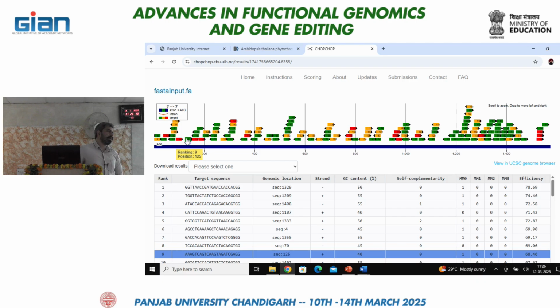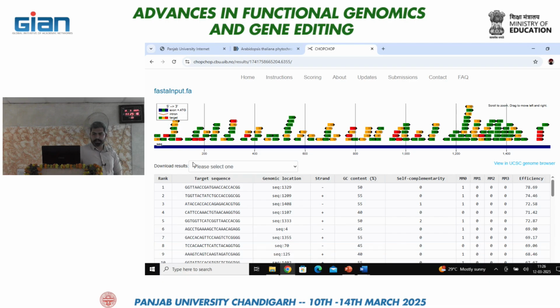Please specify what target sequence you have selected, and how long it is. If the CDS is short, then it is possible.